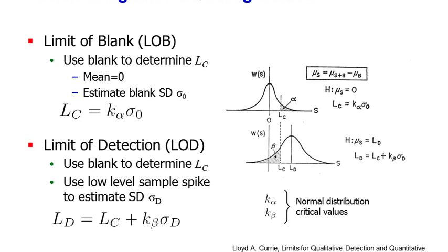So now if you make a measurement and your measurement was 5 times the standard deviation of the blank, then there is a very small probability that it is actually blank. So there is a very high probability that you are actually measuring something in your sample. And so you say your analyte was detected in your sample. So this is like after doing all your measurements.